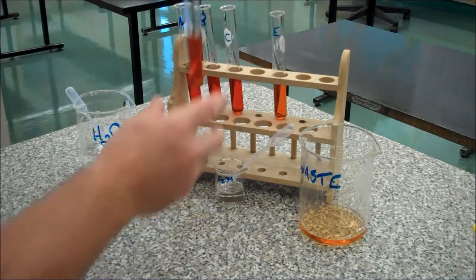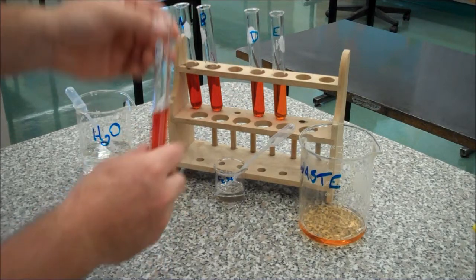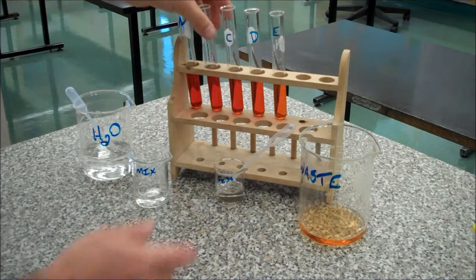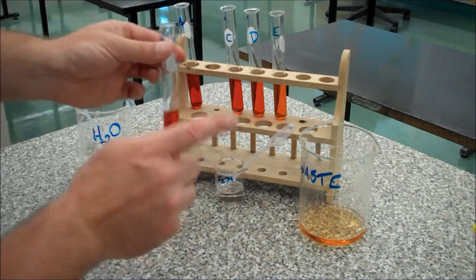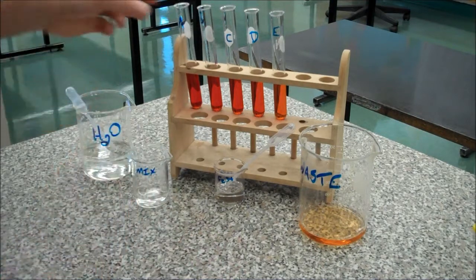You'll note that the colour is gradational from left to right — so in the first test tube it's a little darker, and then a little lighter, lighter, lighter. That is a serial dilution — you are making a dilution of the previous dilution.